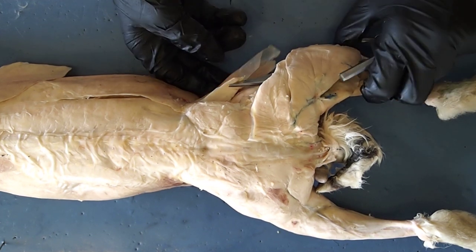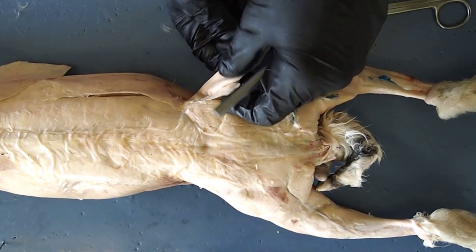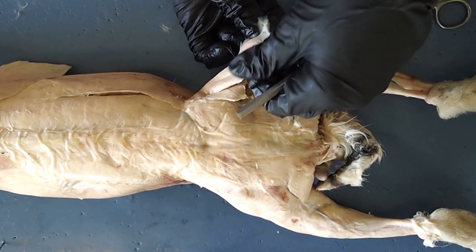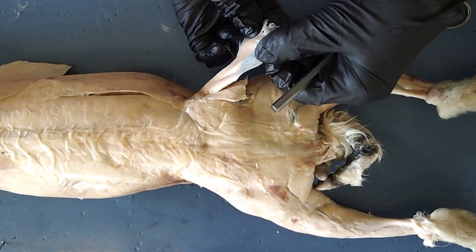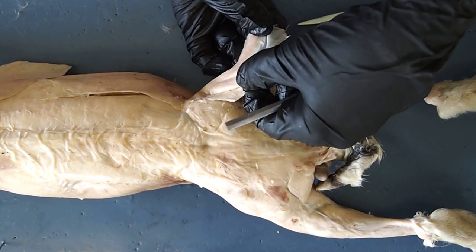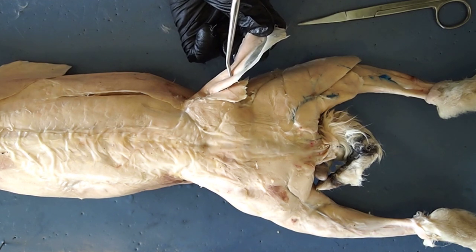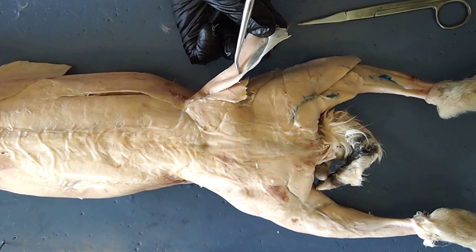Another muscle that's going to help to stabilize the pelvis when your legs are moving is this large muscle right here. You're going to see it has a very broad piece of connective tissue that is called fascia. This muscle is called the tensor fascia lata, and it helps to stabilize your pelvis when you're moving, walking, or running.